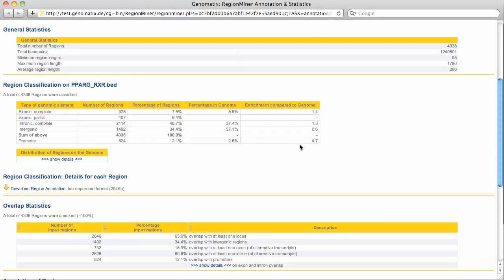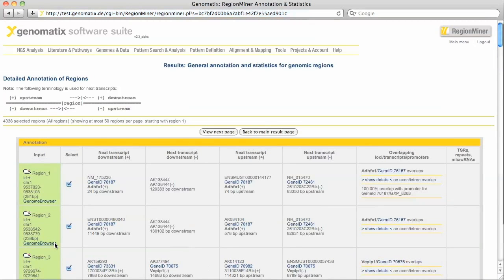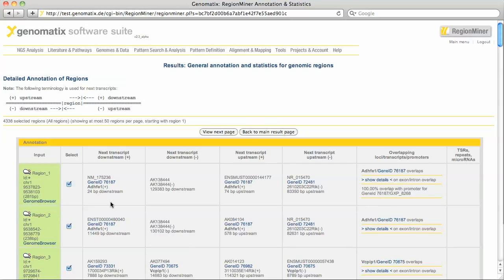There are a number of different outputs for this analysis. The details for every region can be seen here. In the detailed next neighbor analysis we see downstream and upstream neighbors, both on the plus and on the minus strand. Overlapping promoters and loci are also shown for each region.